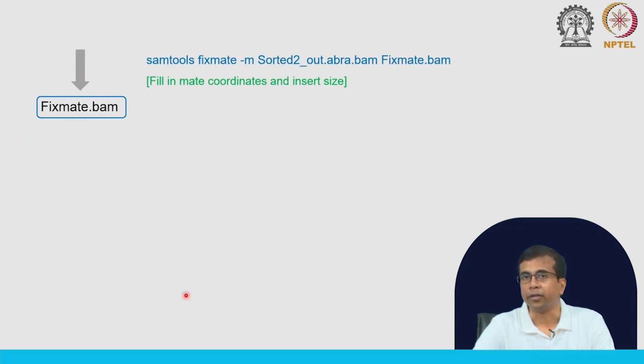Now, what we want to do is mark duplicates, right. So, these steps are preparing for marking duplicates. Sorting by name means we are putting these paired reads close side by side, right, because the names of these pairs would be identical.